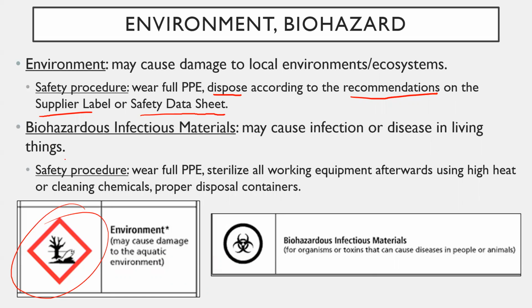Next one, biohazardous infectious materials. In Science 9, we don't deal with this, but when you're in Bio 20 or Bio 30, in grade 11 or 12, you likely will be dealing with things like this. These are things that may cause infection or disease in living things, right?